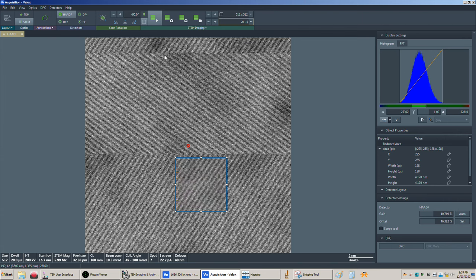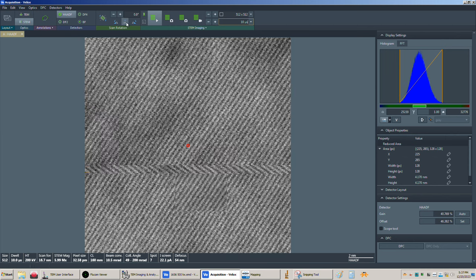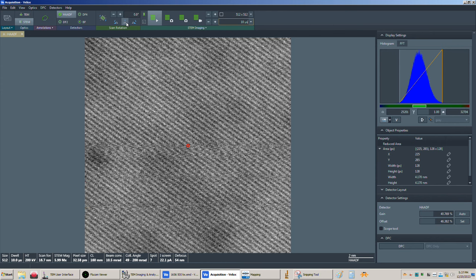Yeah, that should have been the dead giveaway, right? That I didn't see the... Because normally what you see with astigmatism is these lines will reorient by 90 degrees, and we're not seeing that. So, yeah, there's got to be something that's malfunctioning here. Could be a field effect or something else. So, okay, but yeah, basic idea is the same, right?